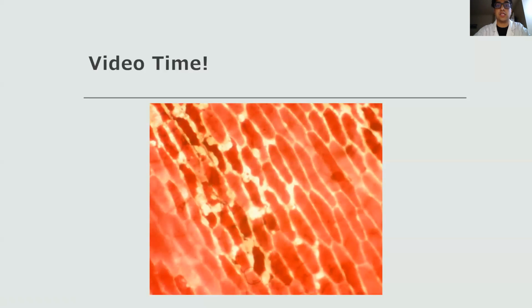Like I said, water is leaving the cell, right? So there is a higher concentration inside than outside. So water wants to leave the higher concentration. It goes from a region of high concentration of water to a region of low concentration of water. So it leaves the cell, allowing it to become deformed like that.